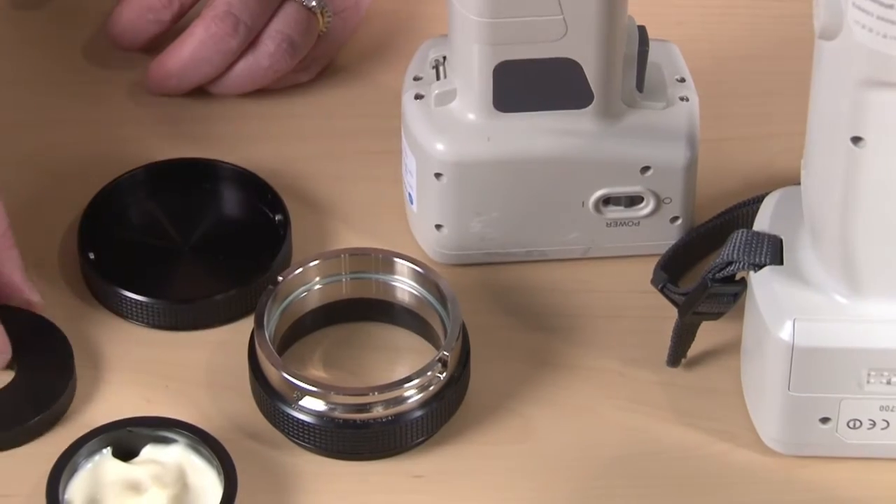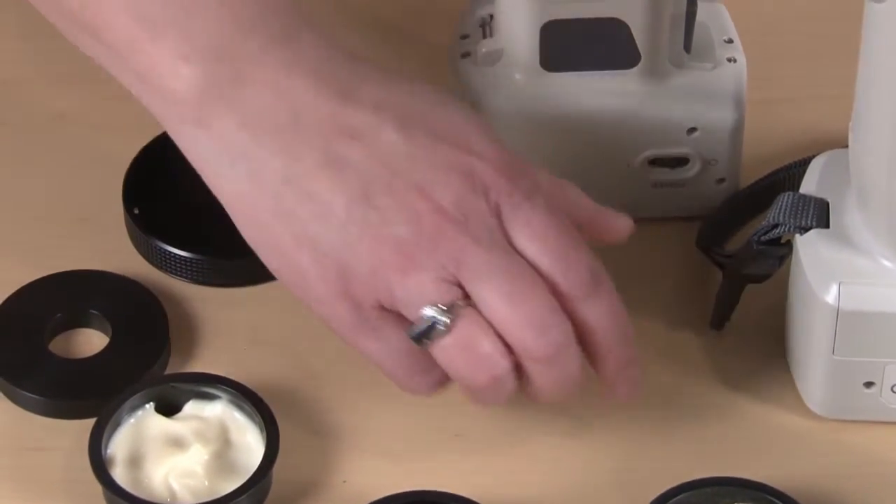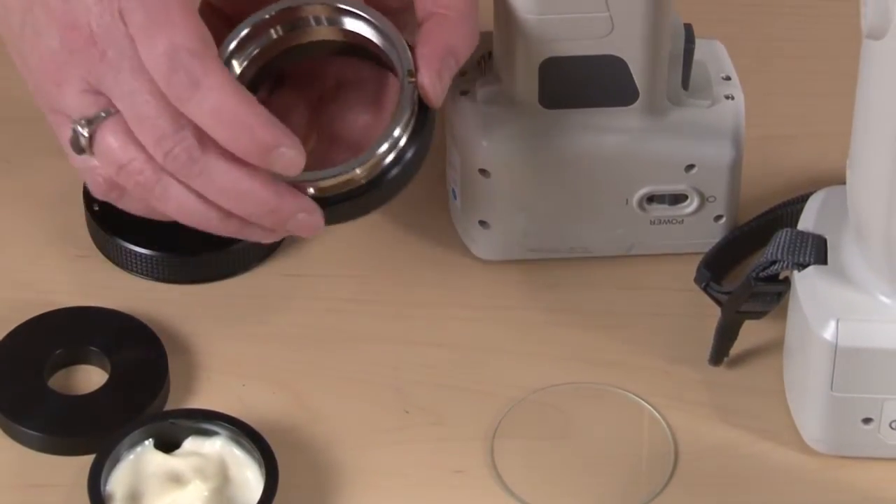It has four components: the collar, a low reflectance glass, the cap, and the ring.